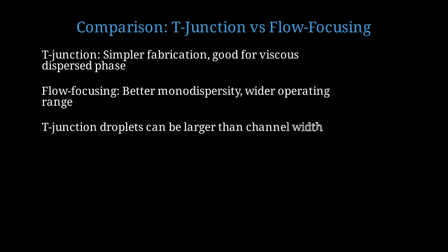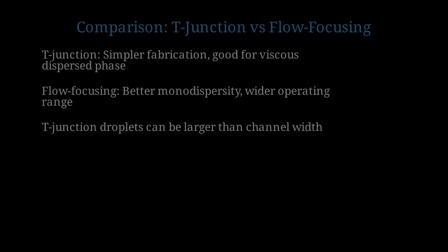T-junctions can easily make droplets larger than the channel width in squeezing mode. Flow-focusing droplets are typically smaller than the orifice width.